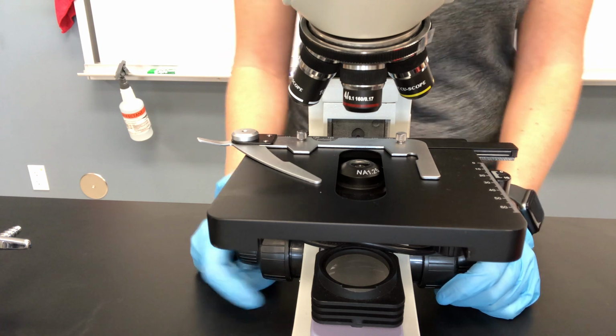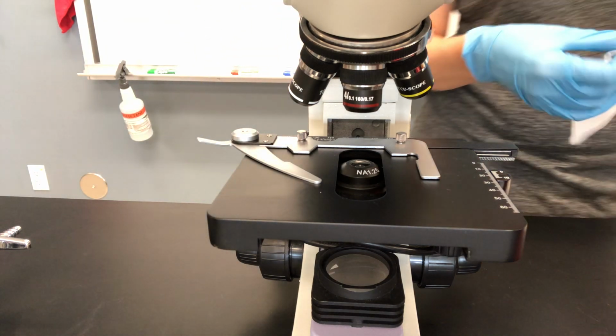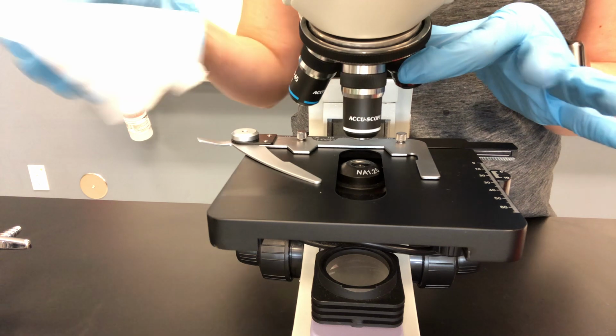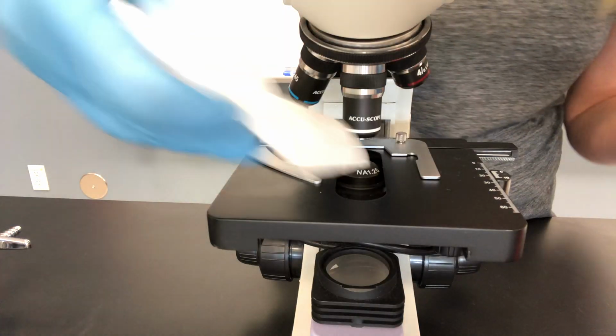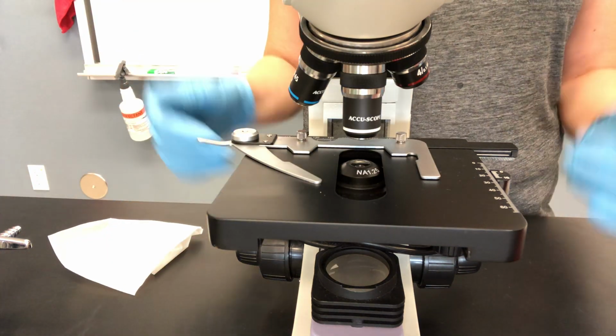And then you're going to get some lens paper. Sorry, I didn't have that close in hand. So then to get the oil off your oil objective lens, because we cannot leave that oil on there, you get some lens paper and you wipe that clean, okay? And you'll notice it'll make like a little oil spot on your lens paper, so you know that you've gotten the oil off, and you can just kind of rub on there to make sure it's clean. So then you're ready to do the next slide.